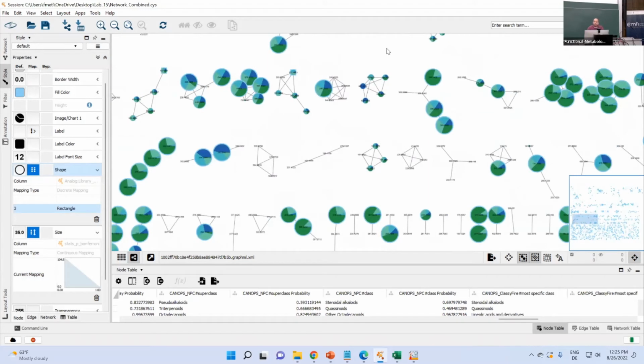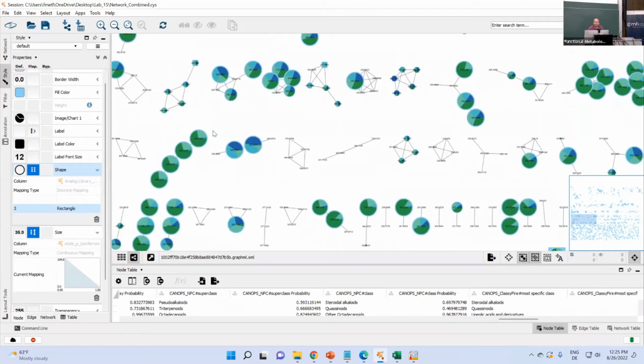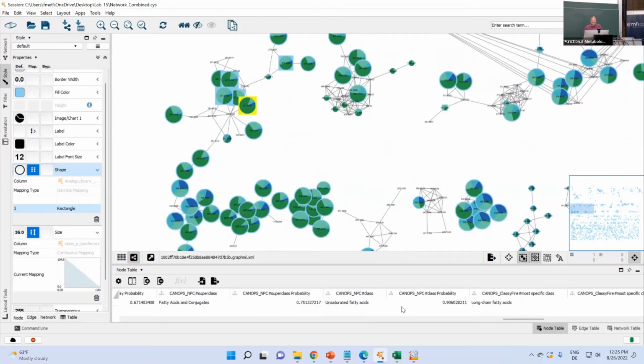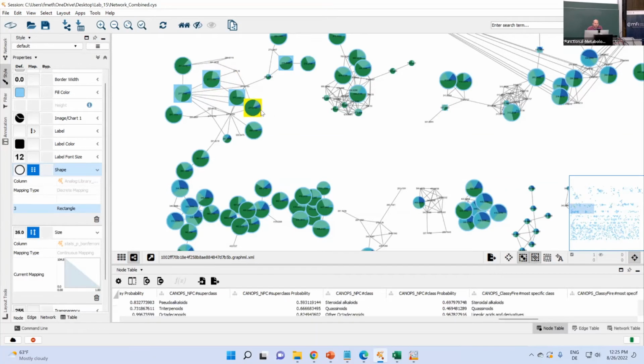I personally prefer the table because this is more systematic, but later for visualization purposes, obviously it is really nice if you indicate abundance directly in the node for your different sample groups. Okay, so now, I would say take a couple of minutes and try this. I scroll in the meantime a little through until I find something exciting, and then we move on with visualizing this down the line.